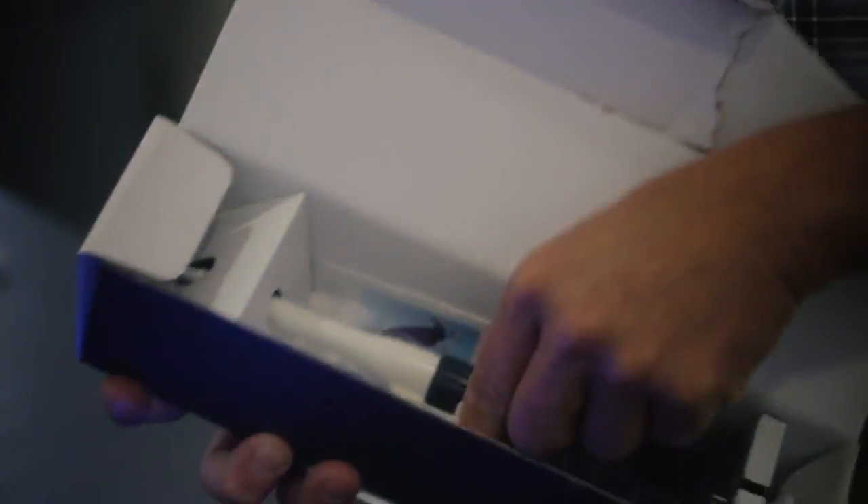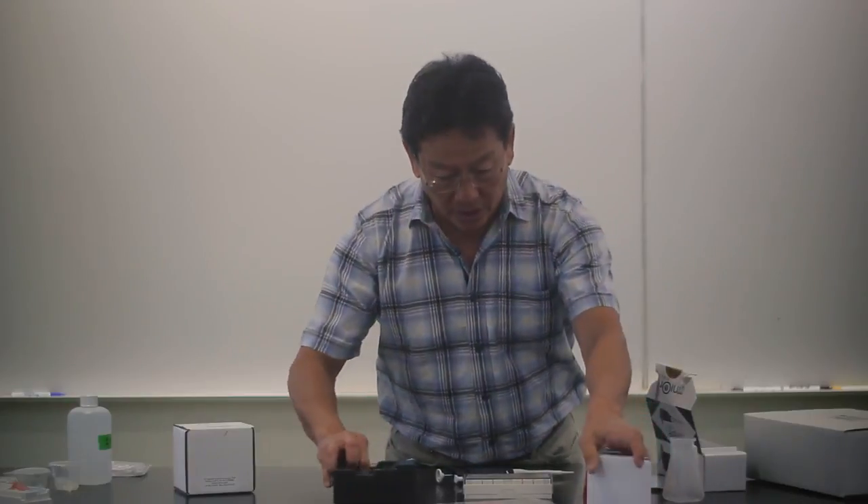So there is a pipette, and it also comes with a self-adjusting volume wrench. So this is what we have.